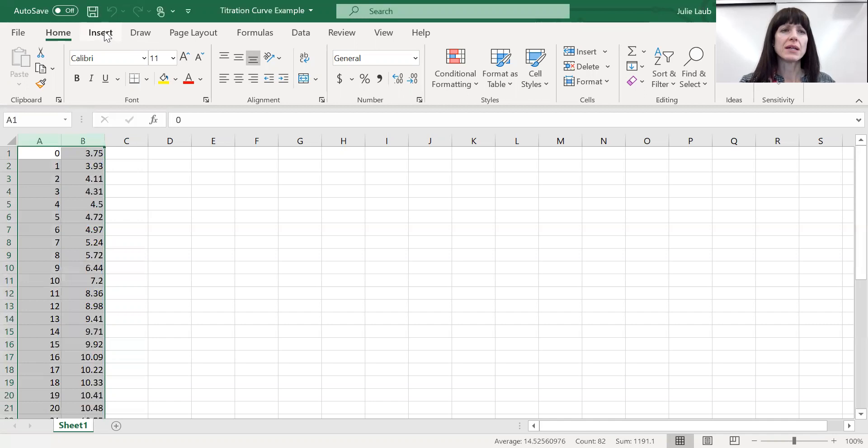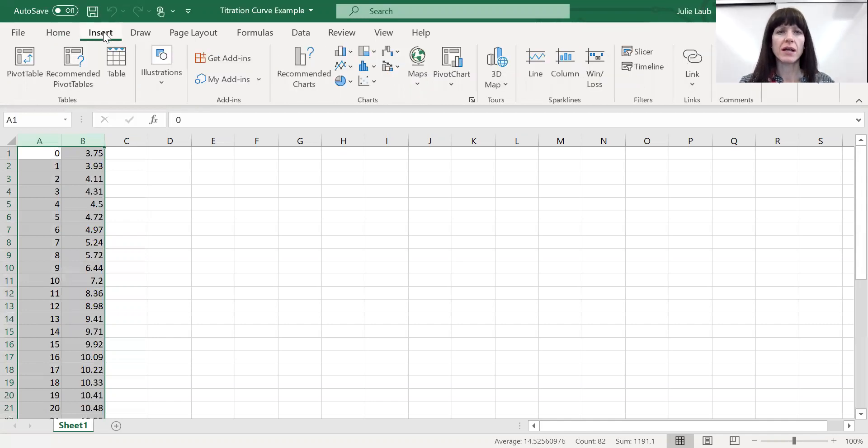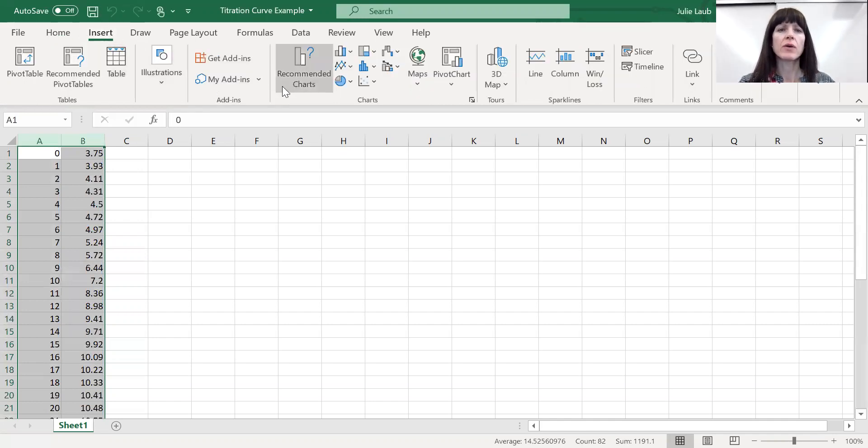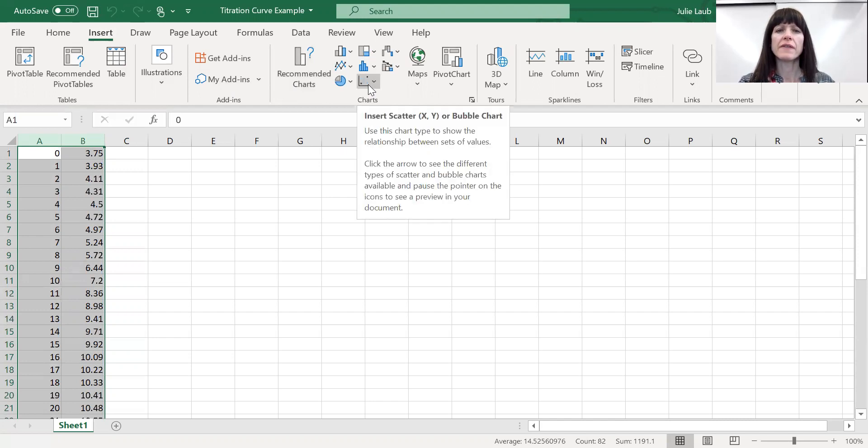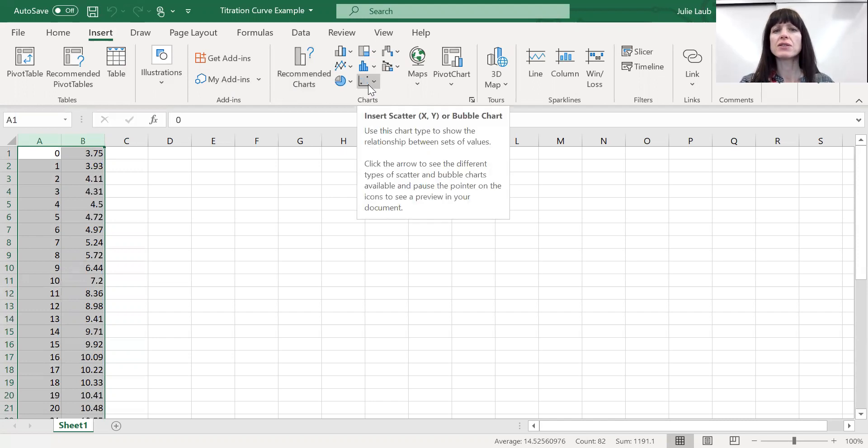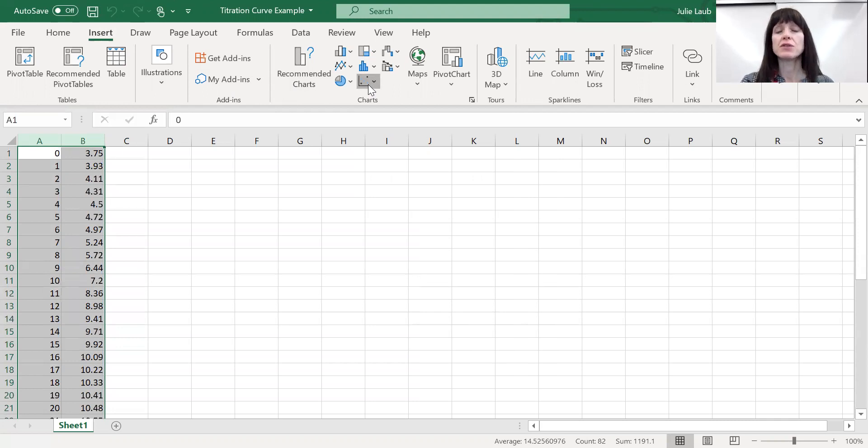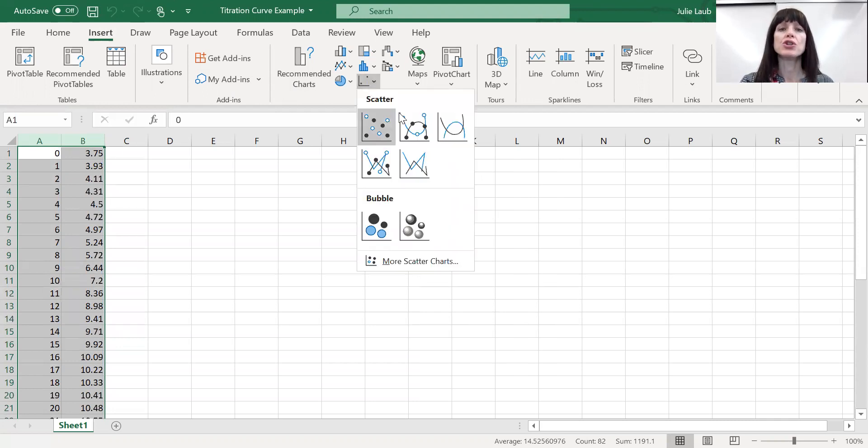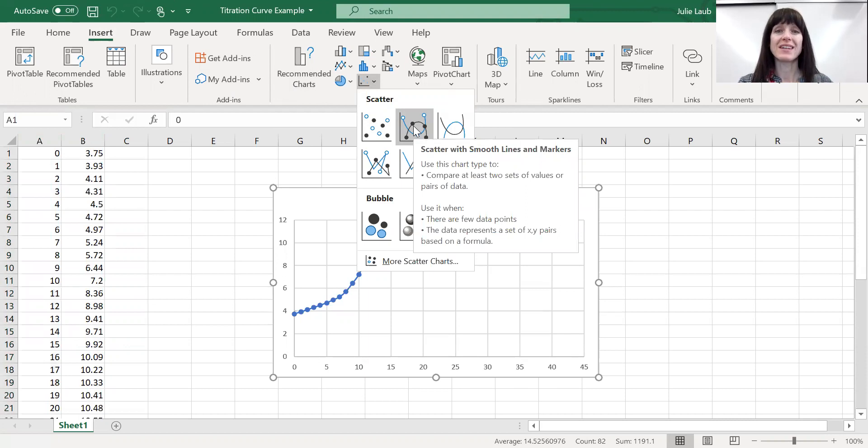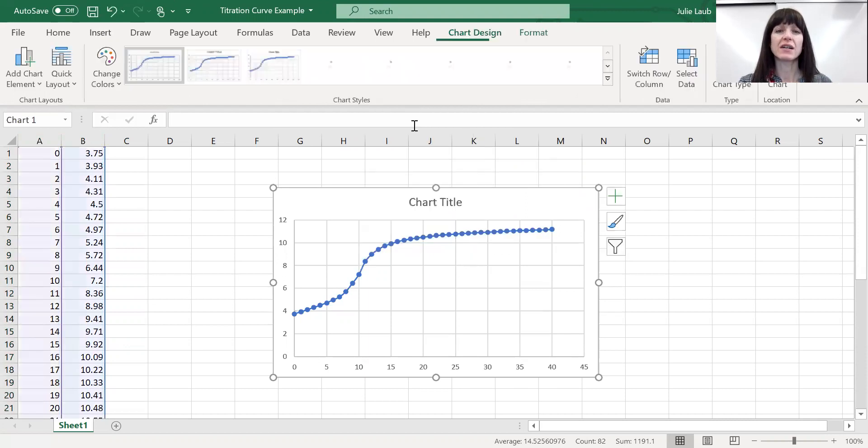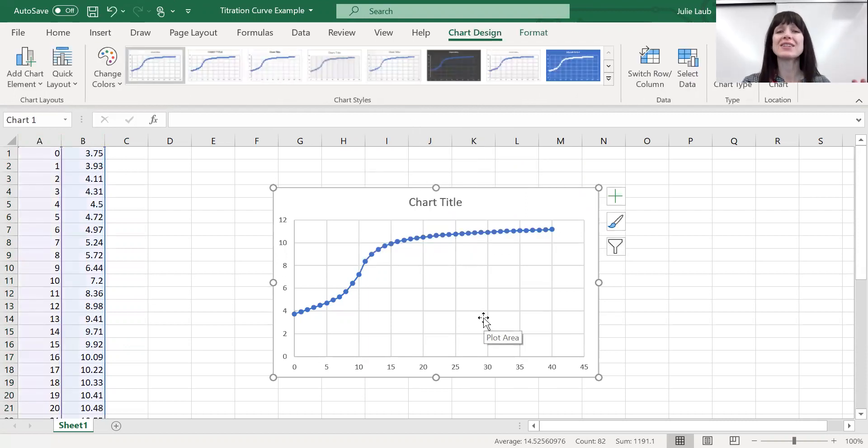If you go to insert, after you have that highlighted, and then when you come over here to charts, you want the chart that says insert, scatter, x, y, or bubble chart. Click on this and it gives you some options. You want the lines to connect. And so click the one that has the lines connecting. I click on that. Beautiful. Look at that fabulous titration curve. And there's your equivalence point.